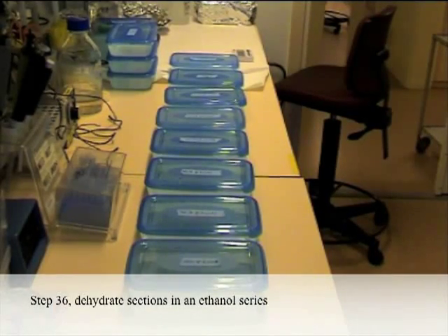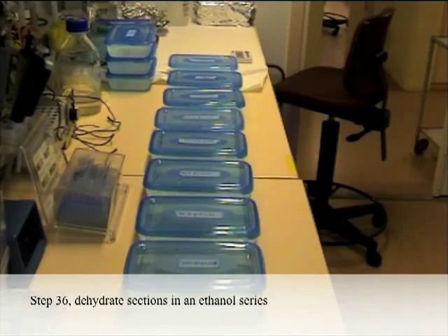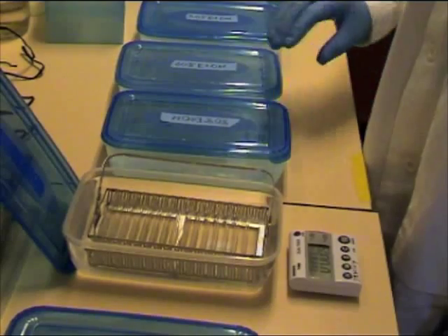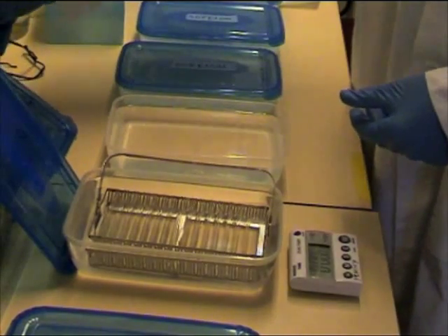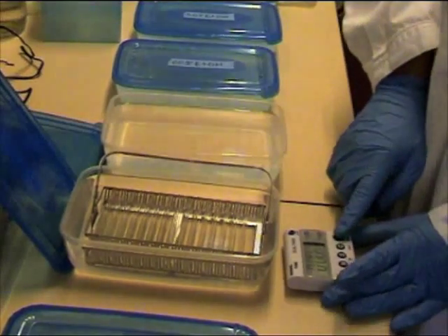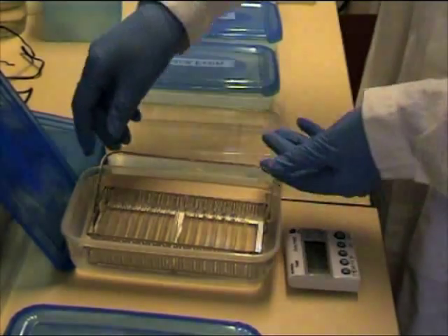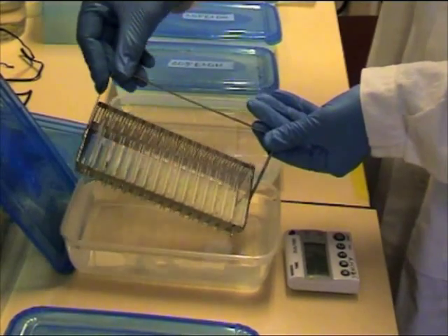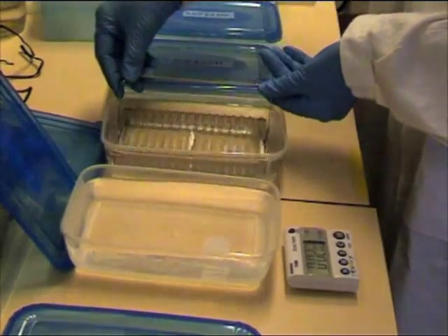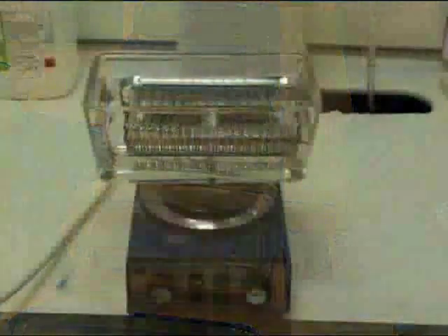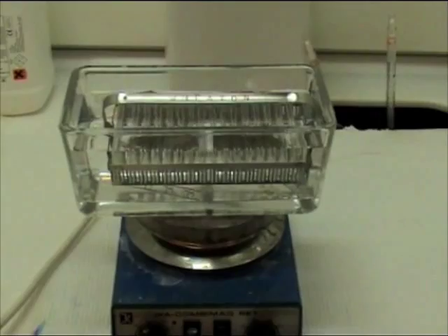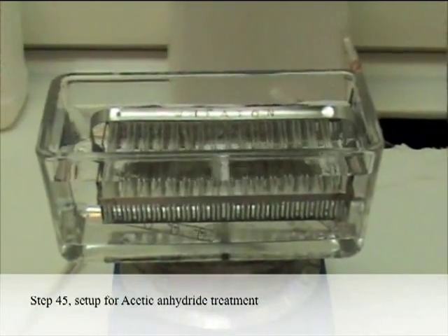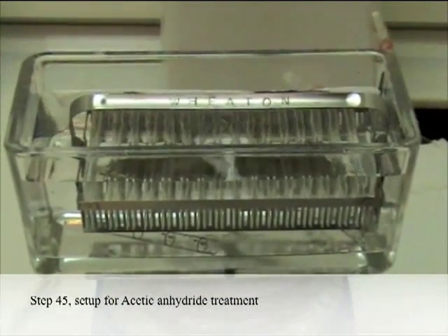Dehydrate sections in an ethanol series. Add acetic anhydride while stirring vigorously. Step 45: Setup for acetic anhydride treatment.